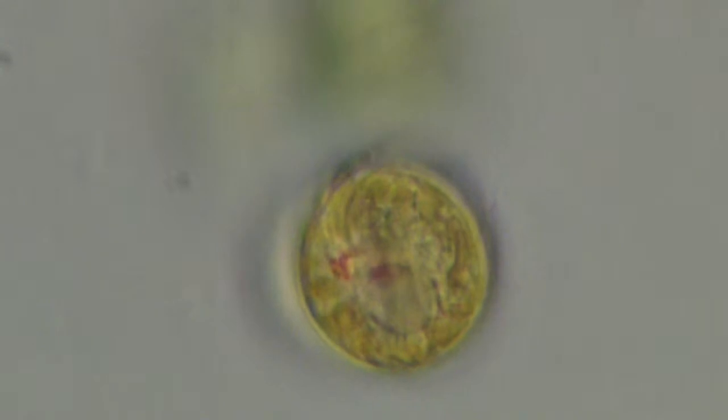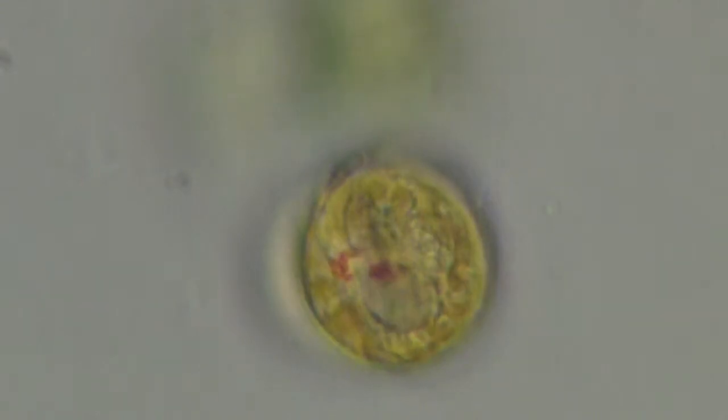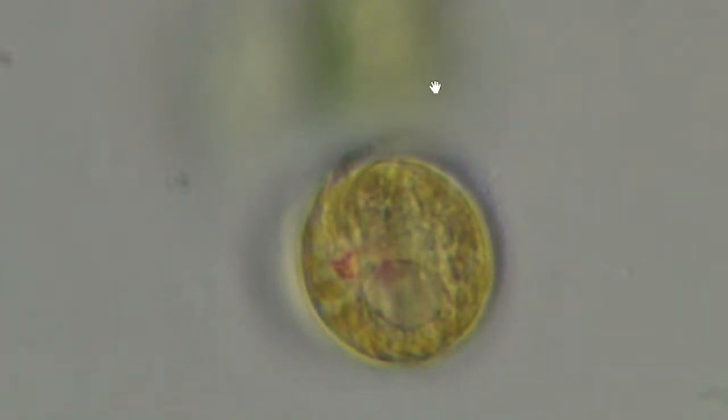Through this guy, you can kind of see the edge of the groove there as I focus. The groove is basically perpendicular to the view I have right now. The groove is basically going like this, so I can't really see it. It'd have to turn on its side, be more parallel, so I can actually see it. But yeah, only the second one I've ever found. And they're out there, obviously. You get red tide, they're all over the damn place, but no red tide right now, so I'm lucky to find one.